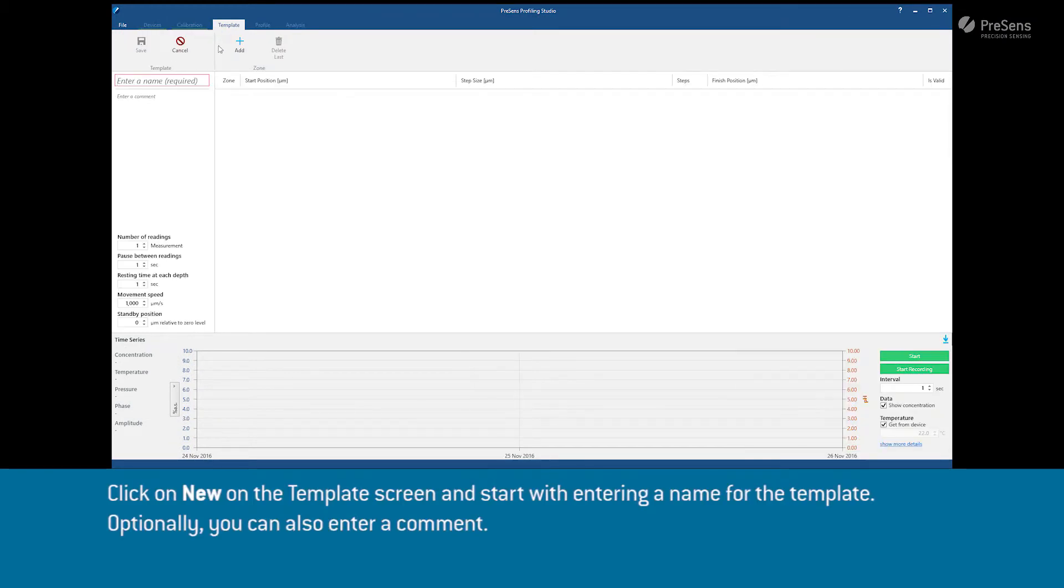Click on New on the template screen and start with entering a name for the template. Optionally, you can also enter a comment.